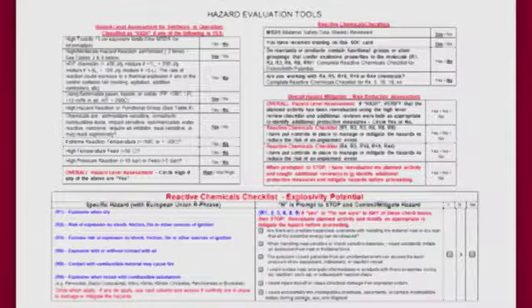Step 4. Use the hazards assessment tools on the back of the SOC. It is provided as a tool to help you determine the potential hazards and precautions associated with your project. You will also find reminders to consult Material Safety Data Sheets, or MSDS. Evaluate specific hazard classes, and develop mitigation solutions.